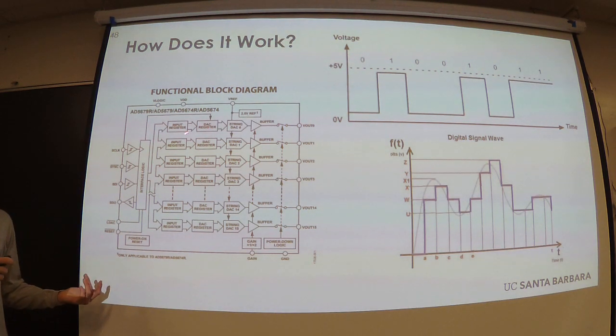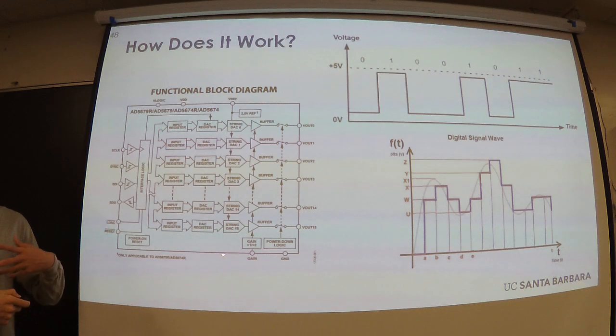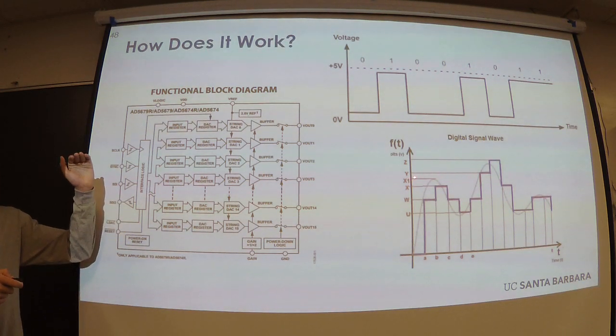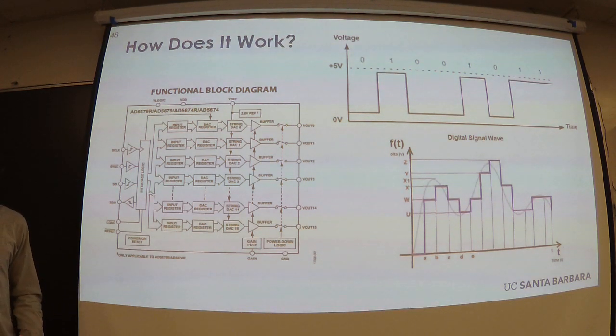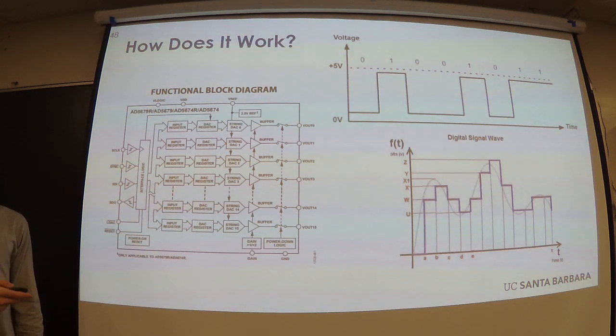And it turned out that the digital to analog converters that I selected had a range from 0 to 5 volts. And to give you a better understanding of that, that means if I put in a digital command of all zeros, it'll output 0 volts. And if I put in a digital command of all ones, it'll put out 5 volts. And I can change these zeros and ones iteratively, and I can step all the way down from 5 volts to 0 volts. And this means that I can take any arbitrary amplitude that a user puts in, and I get a nice square wave at the end.